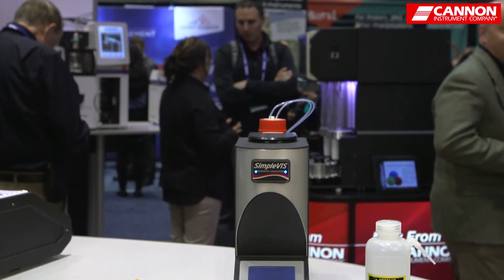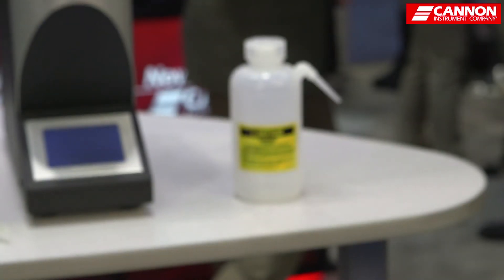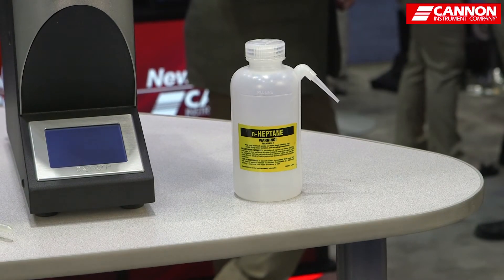Hello, I'm Tom Zubler with Canon Instrument Company. I'm here today to talk about the Simplevisc viscometer. The Simplevisc was developed for industrial accounts as an easy to operate instrument. It's designed to be able to distinguish between products, so that in the distribution world we can tell whether it's 10W30, 10W40, or some other type of material.